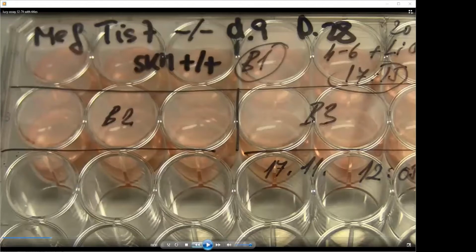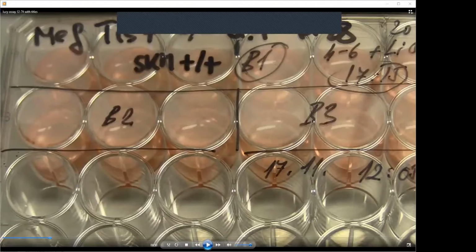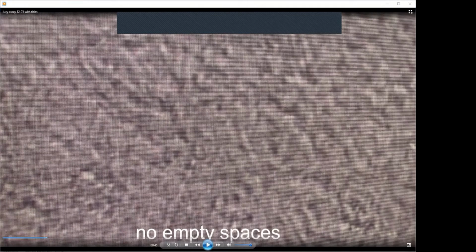But the problem is that also most probably the efficiency of transfection would be not very high, because if you overexpress some foreign proteins in large amounts, then usually cells don't do very well and they are not growing so fast.